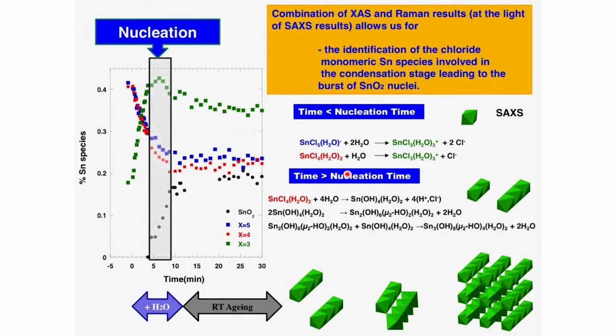At the advanced stage of water addition, during the nucleation stage, we saw that this species, the trichloride species, showed a plateau. That means that this species is not responsible for the formation of tin oxide nanoparticles.